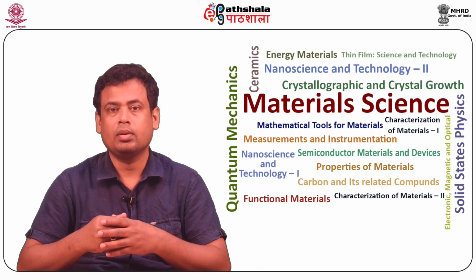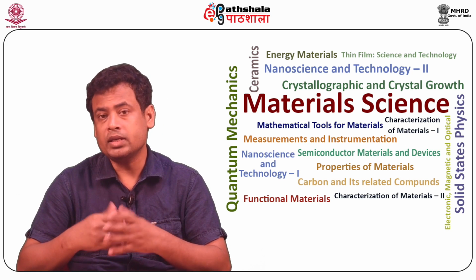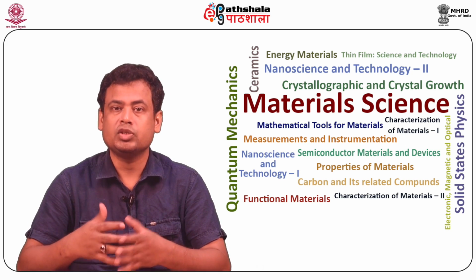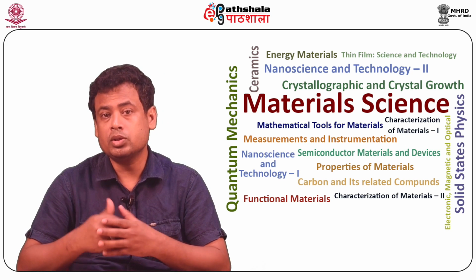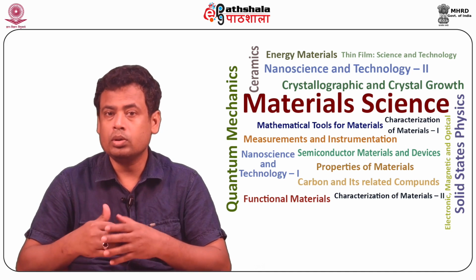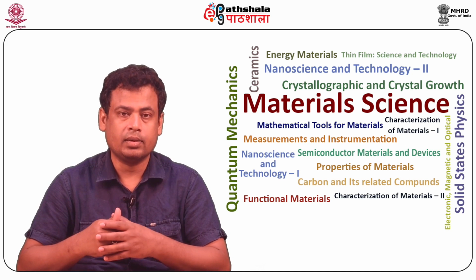The second method is to collect the signals with use of systems employed in transmission electron microscopy or scanning transmission electron microscopy, where initially the sample is immersed in the lens field, with the low energy electrons spiraling up the field lines through the hole in the upper pole piece and finally collected by a small transverse electric field.